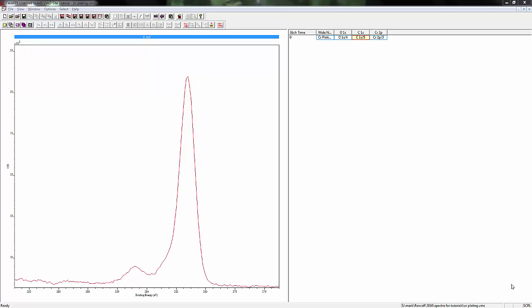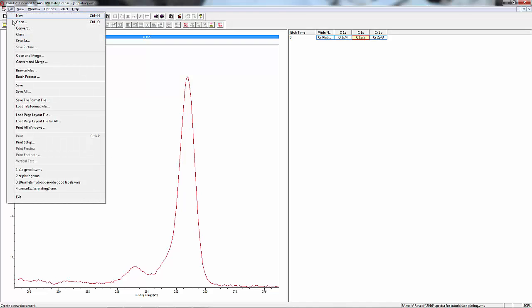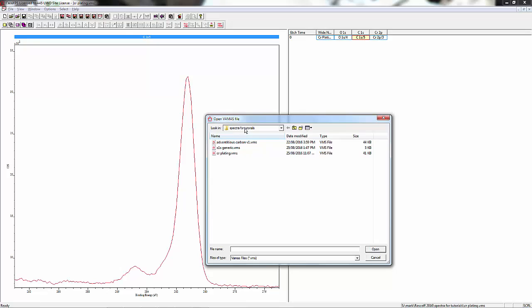Charge correction of a spectrum is a fairly straightforward process, especially if you're using carbon 1s as adventitious carbon to do so. What we're going to do is open up the file that we've made previously for our generic adventitious carbon.